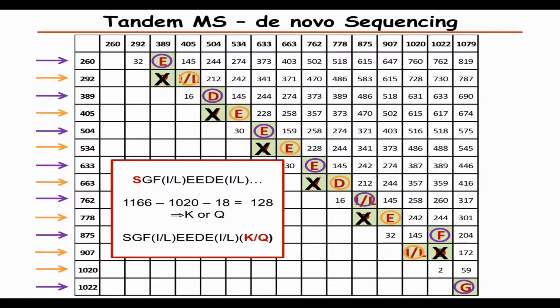So now, for very good spectra, this can be done by hand, and even for not so good spectra, you can do it as long as all the information is there. But if you can imagine, if there is missing information, it gets very complicated. You're also going to play with a few spectra afterwards, at the end, to find where they are phosphorylated.